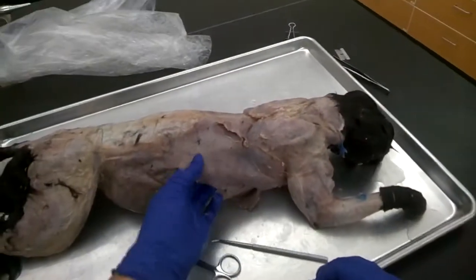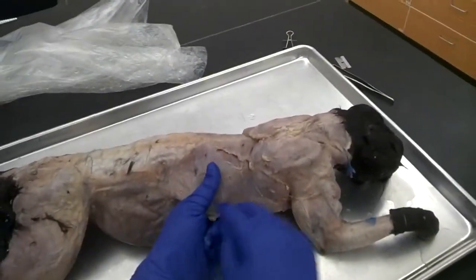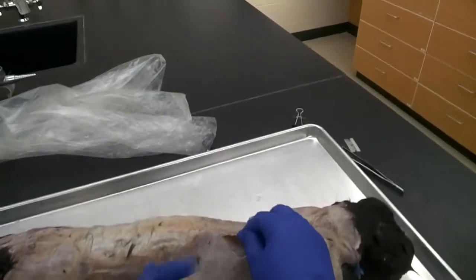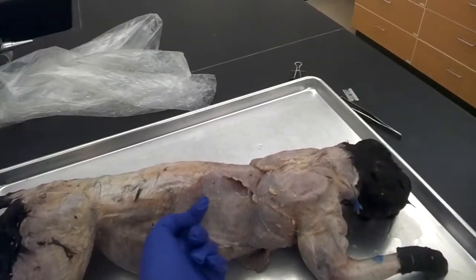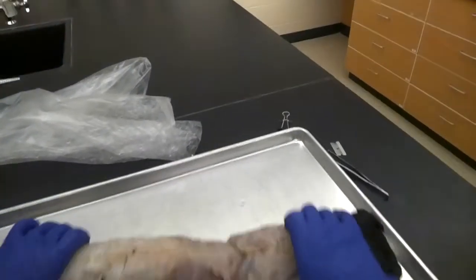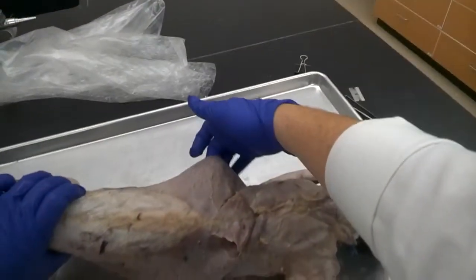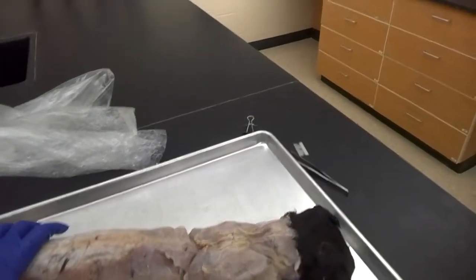So far I have a latissimus dorsi separated — if I go all the way under it, I can poke my fingers up a little bit. I'm under latissimus dorsi, but I still have that smaller muscle on top, which is the spinal trapezius. You're going to see the same thing on the other side: there's the spinal trapezius and there's the latissimus dorsi. Go ahead and get those four muscle portions dissected out.